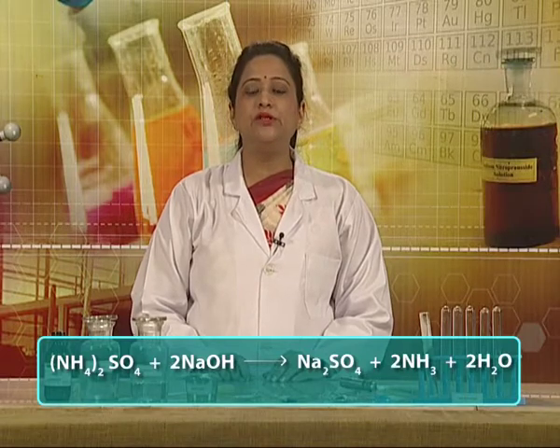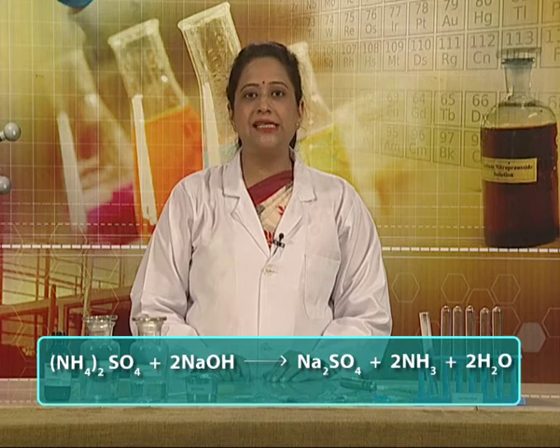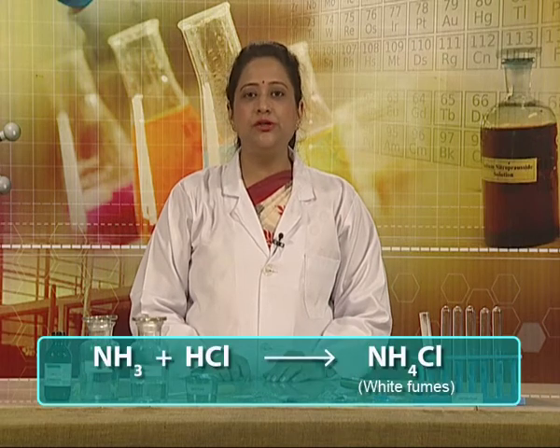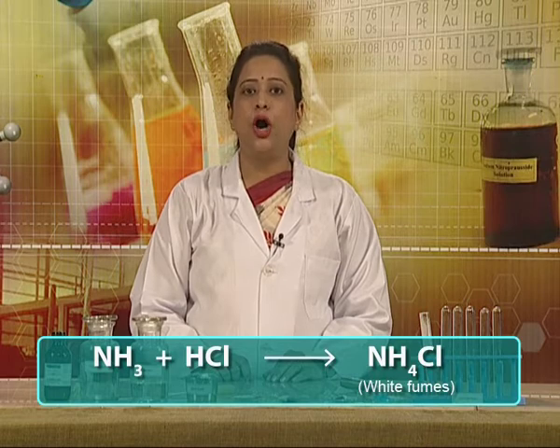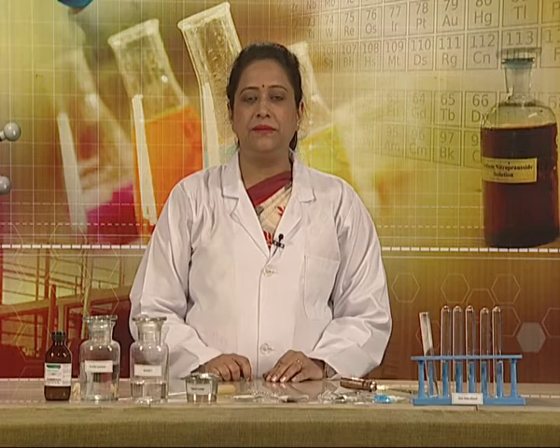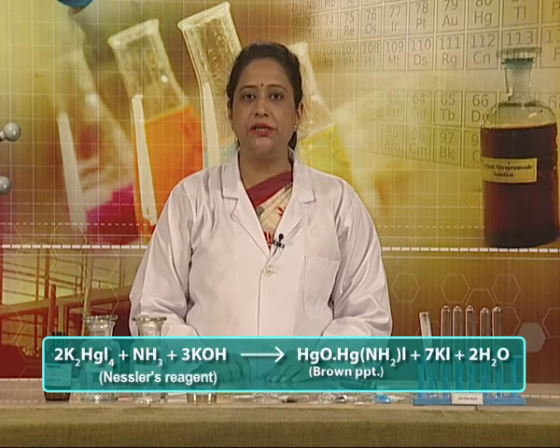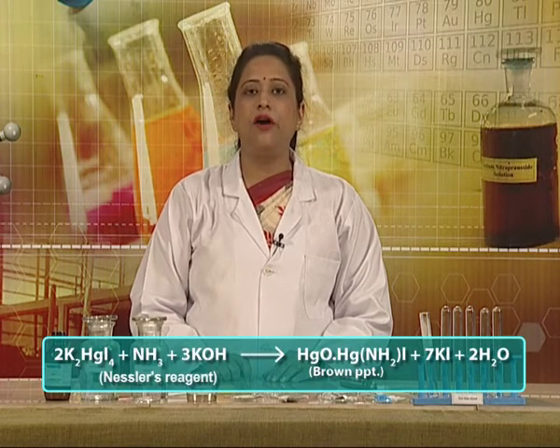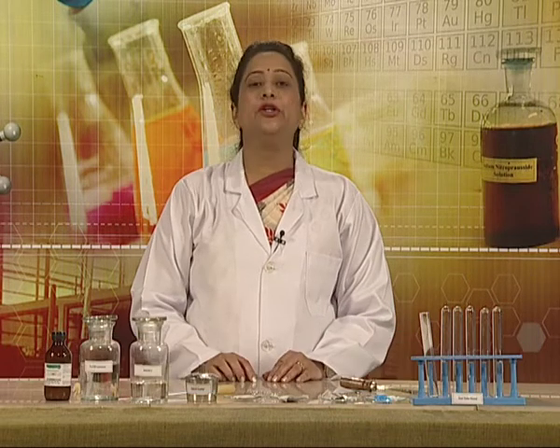On heating an ammonium salt with NaOH solution, ammonia gas is evolved, which produces white fumes of ammonium chloride on coming into contact with dilute HCl. When ammonia gas is passed through Nessler's reagent, a brown coloration or precipitate of basic mercury(II) amido iodine complex is formed.